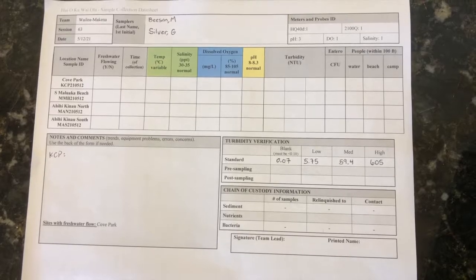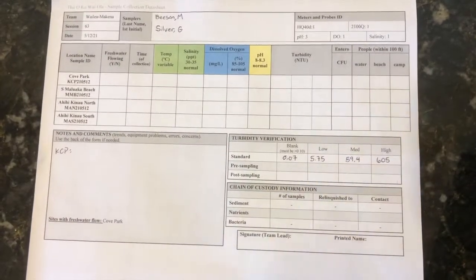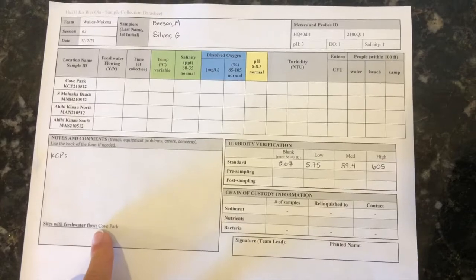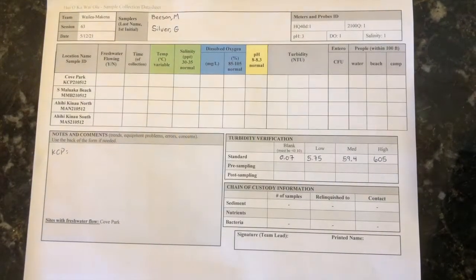Record if there is a stream flowing or freshwater influence in close proximity to the site. Sites with potential freshwater outflows will be listed in the notes section on the datasheet. There will also be a freshwater outflow guide in the field binder with stream and freshwater outflow locations clearly marked in reference to the sampling site.